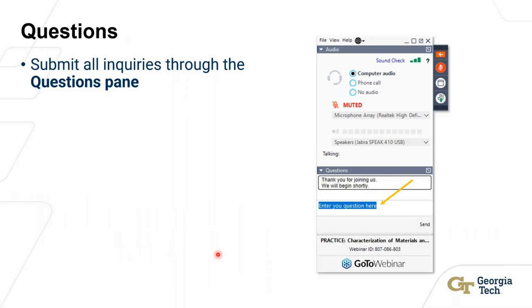It's all just direct detection. We've done the same work using scintillator-based cameras, something like a OneView, and you can still get pretty good results. It's just once you get to lighter elements, the noise levels get too high and you're not able to get reliable orientation maps anymore. So yeah, it's all with direct detection technology.